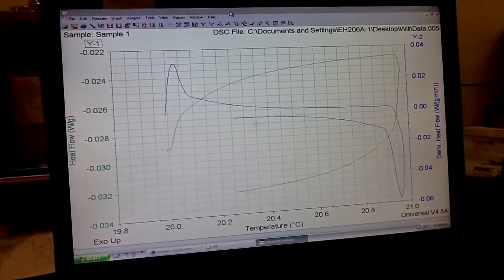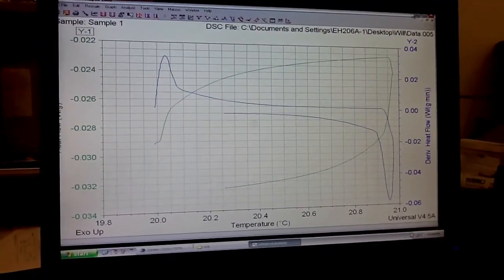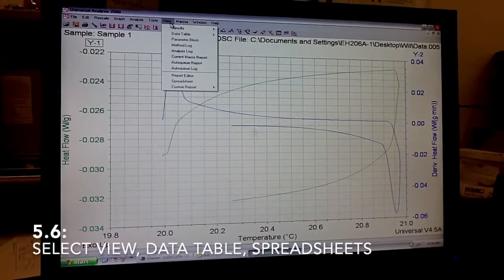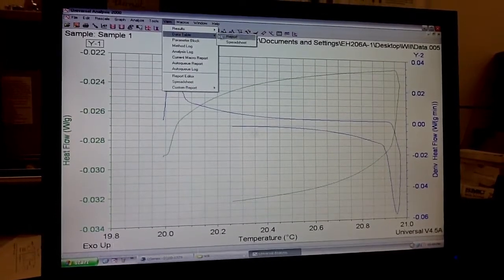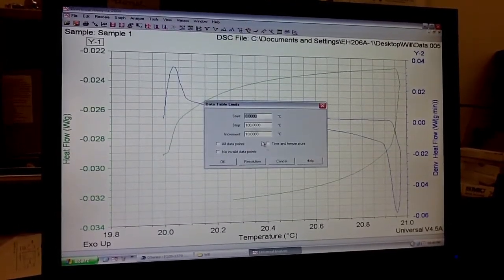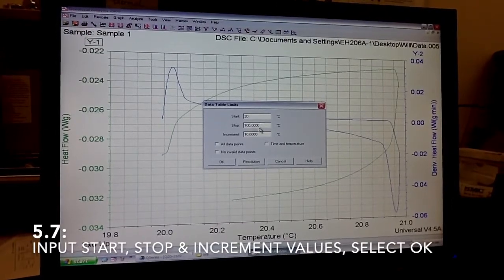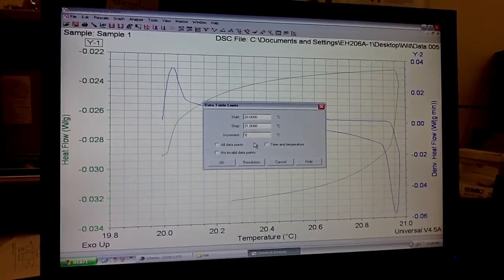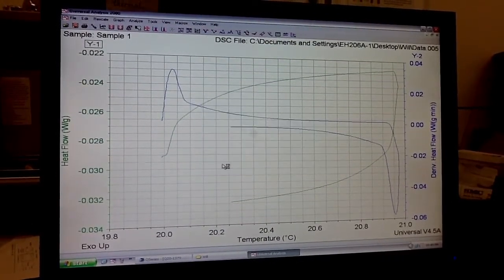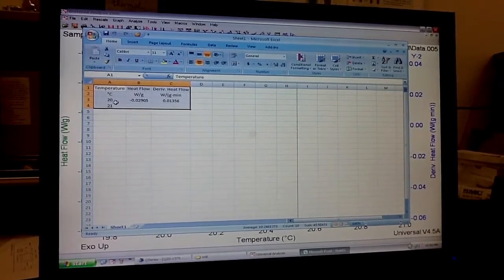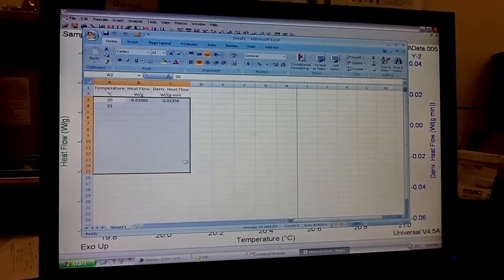And once you have this screen up, then you can come up here to View, Data Table, and Spreadsheet. Put in the parameters here. And it will pop up with an Excel sheet that you can use.